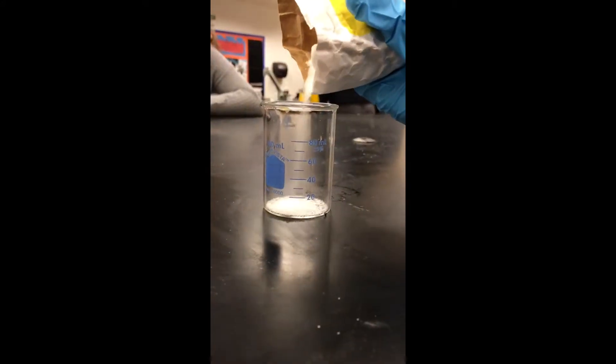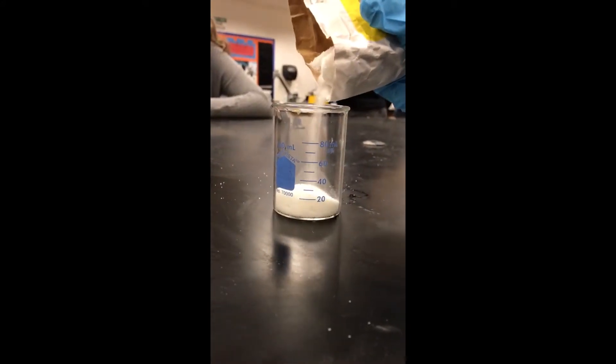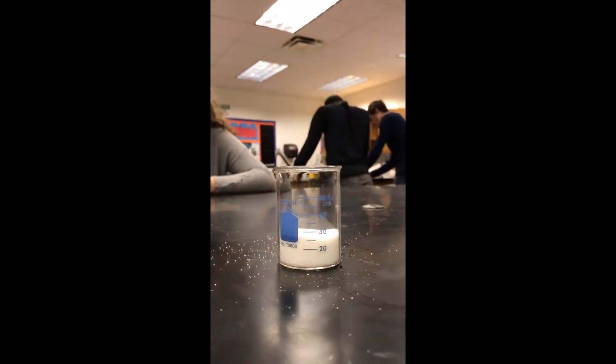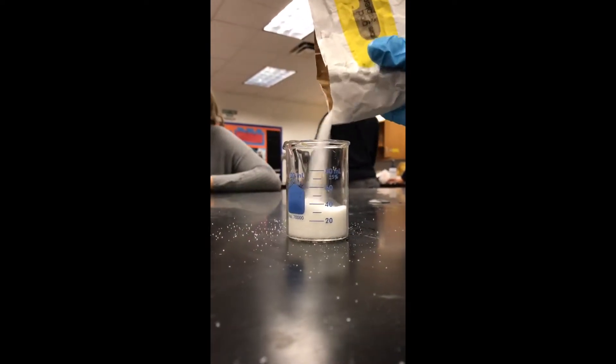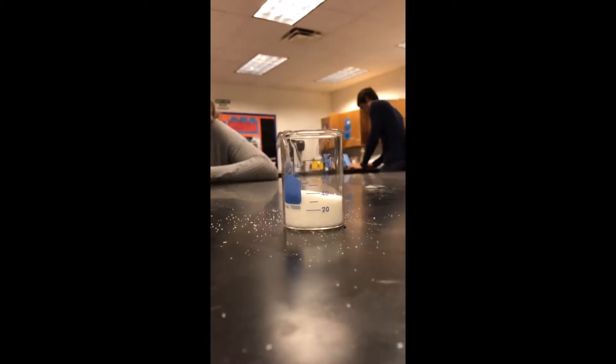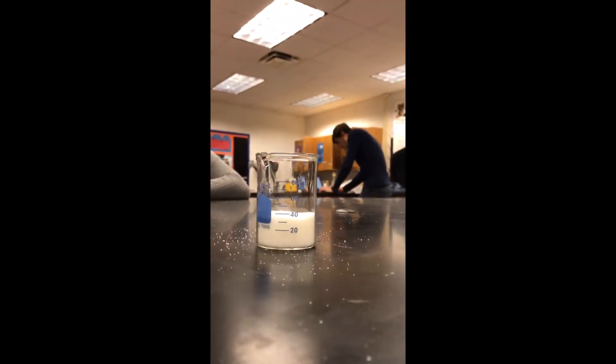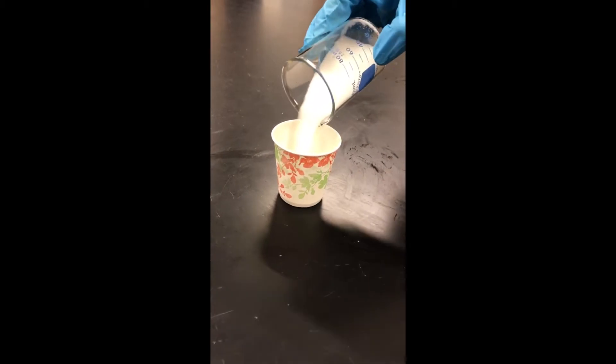In order for this experiment to work, we're going to need about a 2 to 1 ratio of sugar to sulfuric acid. So, we're going to pour enough sugar until about the 40 milliliter mark on the beaker. Next, we pour the sugar into the Dixie cup.